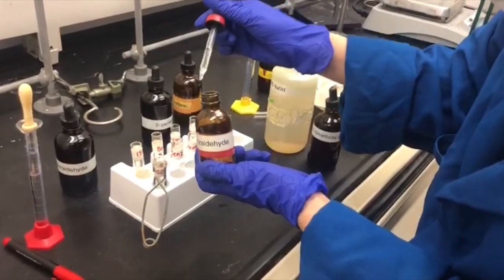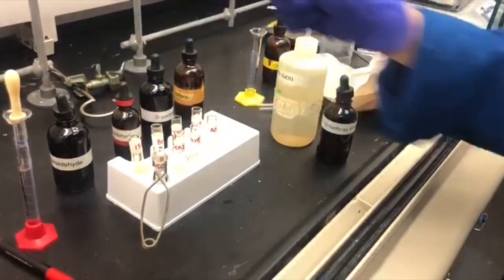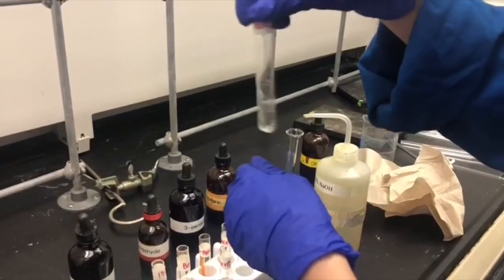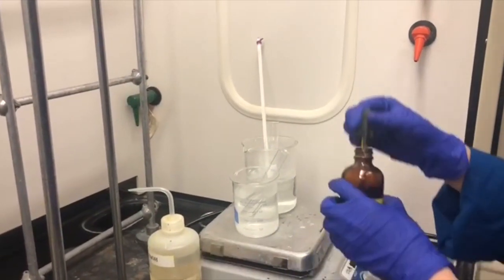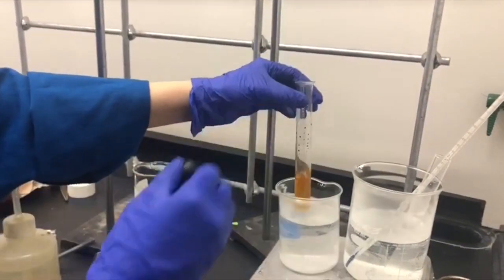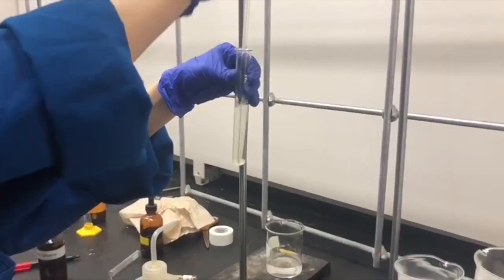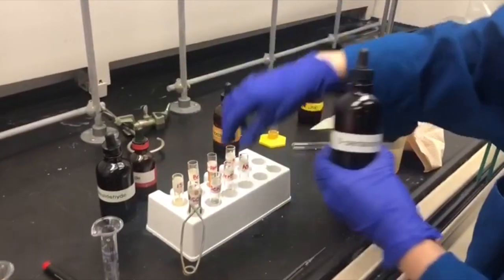Moving on to our next known compound: I'm adding 5 drops of benzaldehyde into the test tube, then adding 2 ml of water. I'm adding 1,2-dimethoxyethane drop wise until compounds dissolve, then adding 2 ml of 10% sodium hydroxide and 2 ml of water, and putting it in the 60-degree warm bath. Now I'm adding the iodine solution until the color stays brown, then adding 10% sodium hydroxide drop wise until the solution turns clear, and back into the warm water bath for 5 minutes.